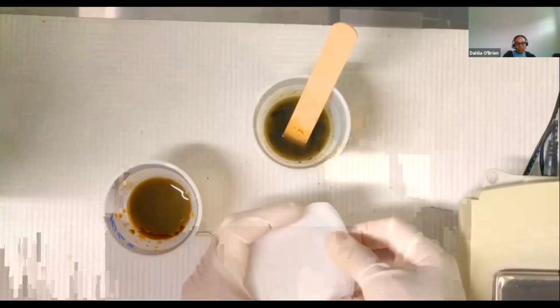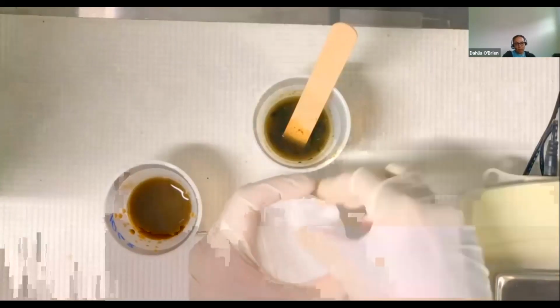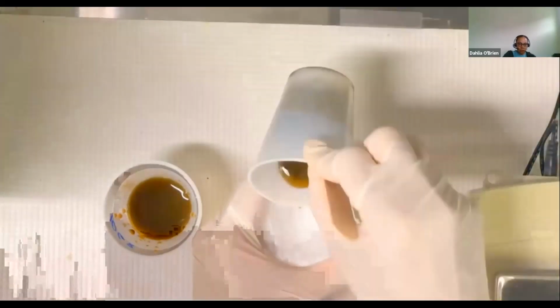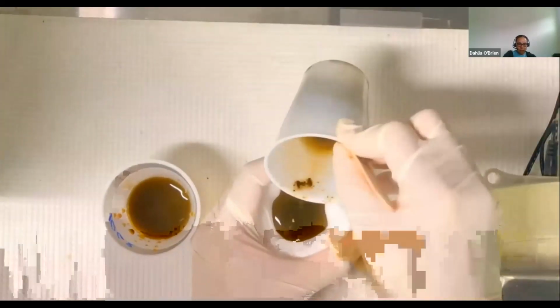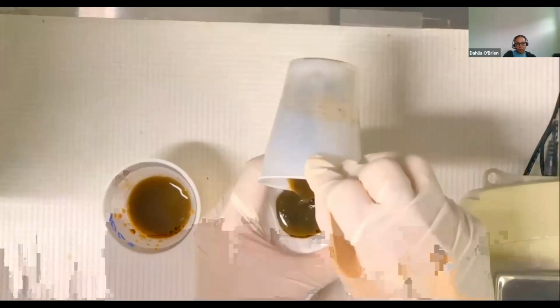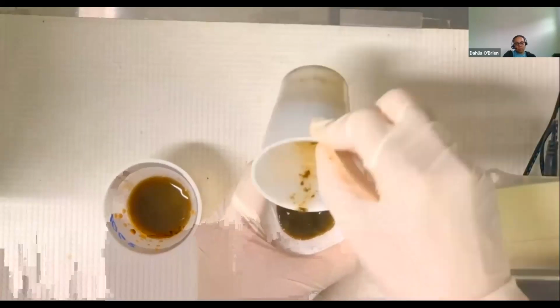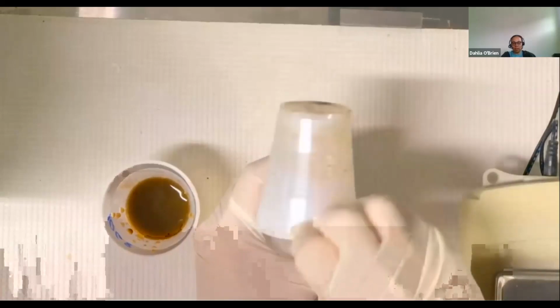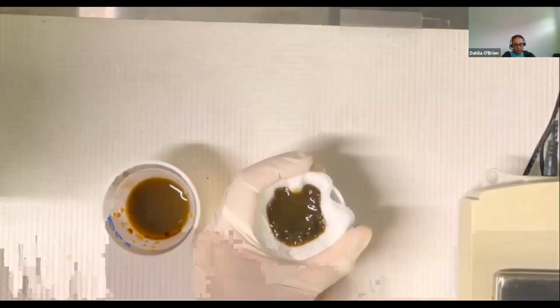Now I'm using the cheesecloth. All you'll do is take a small square, put it over the mouth of the cup, and make a small depression so you can add your suspension. Sometimes, to get all the material, you want to stir that cup a bit so you can get everything into that second cup.